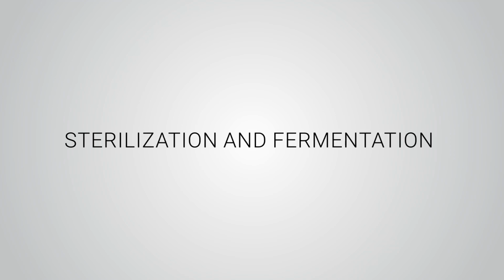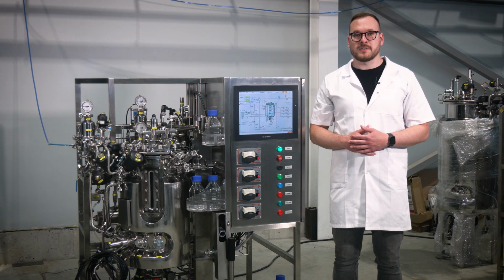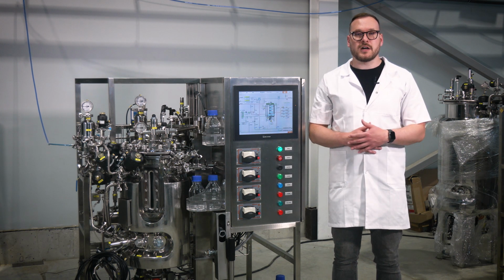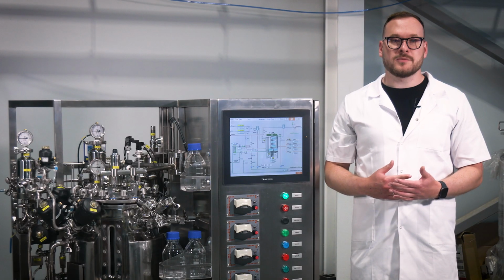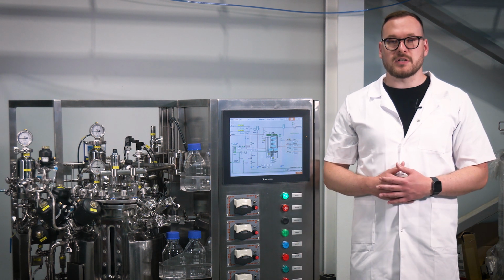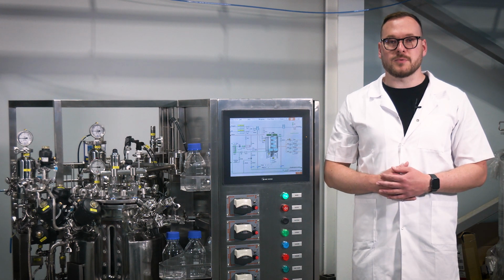Sterilization and fermentation. Welcome to the video manual for operating the fermentation system. In this video, we will guide you through the necessary steps to ensure a successful fermentation process. Before we begin, please note that full system sterilization is highly recommended before starting any fermentation processes.